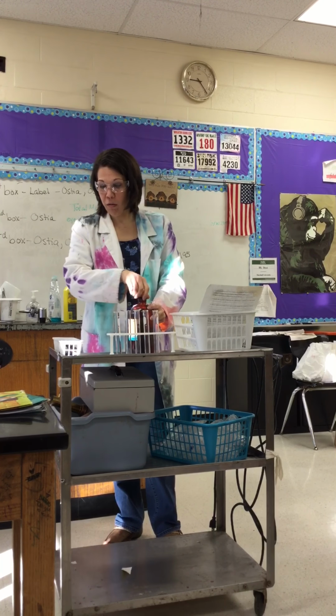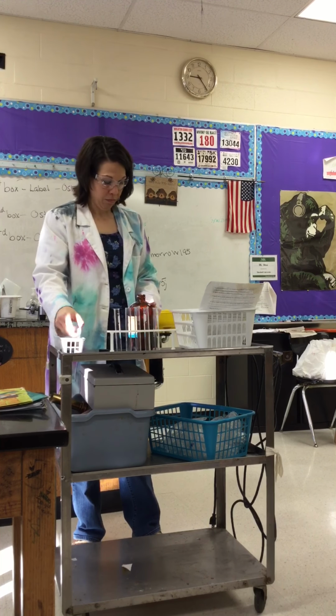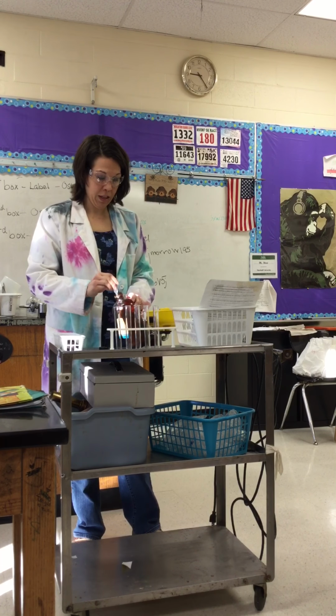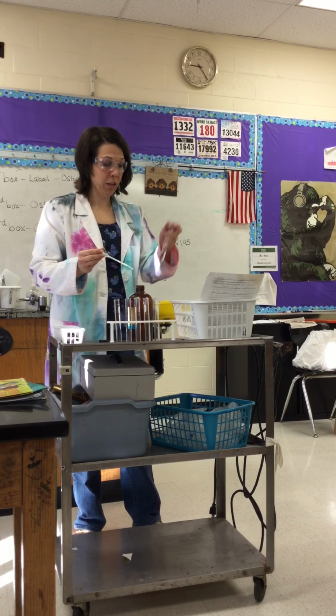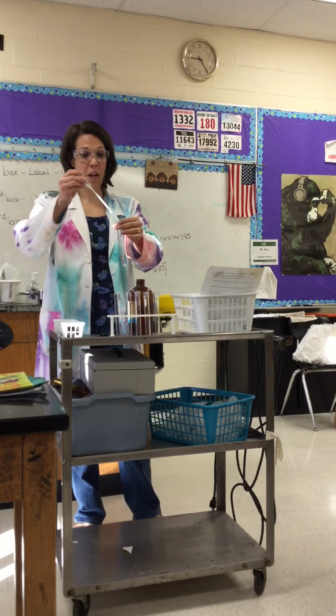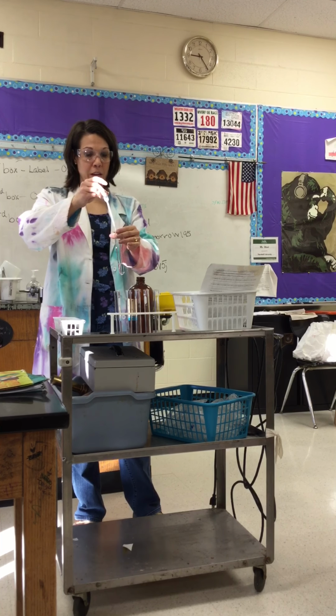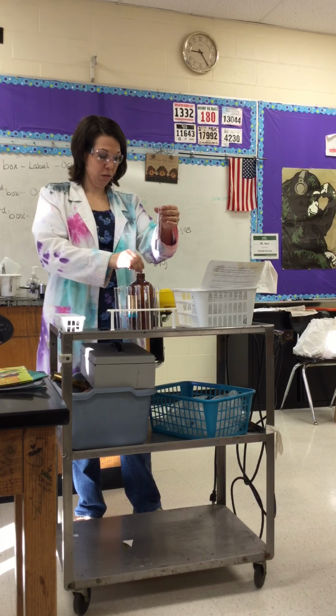Okay, so with corn oil, we say that fats are non-polar, so that means they don't like water. One of the first tests you can do is put a test tube with water in it, and put your fat, or your substance, in there.